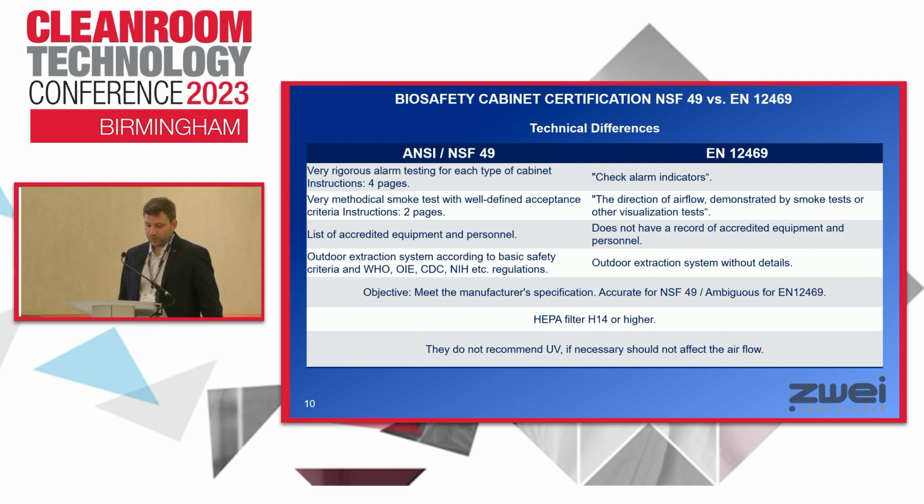About the extraction system, NSF follows the basic biosafety criteria in the biosafety literature, but EN doesn't have any details about how it should be done and allows direct connection. For example, under EN, an A2 cabinet may have a direct connection instead of a canopy connection, putting at risk the user and the environment.